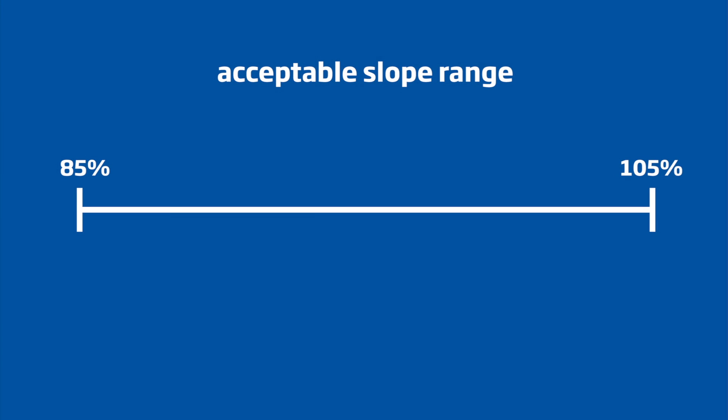The final step for determining the condition of your electrode is to make sure that these values produce an acceptable slope range. The acceptable range for a good electrode is between 85 and 105 percent slope.